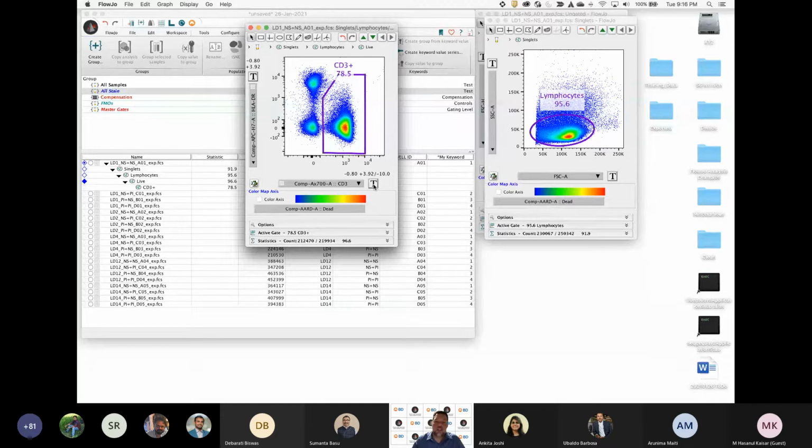The way we can change the data is by going to this T button, T for transform, and we can go to a straight log axis or a linear axis, or to customize axis, which is where I would go to make modifications to a bi-x transform. Because with a log axis, if we do it on these data, I'm missing now half of my negatives. Any events that are actually below 0 on a pure log scale won't be displayed. This is half of my negatives, and it gives me a warning: 9% of events are off the chart edges. That's everything that was below the visible range in this pure log scale.